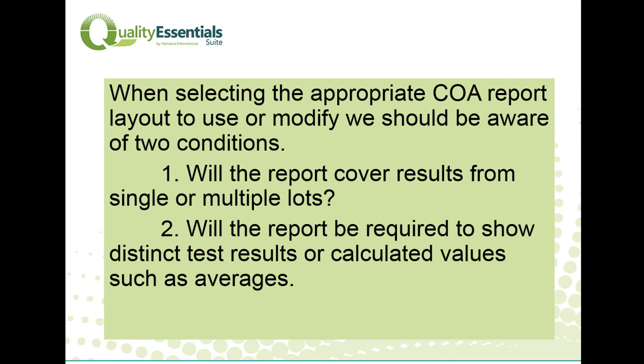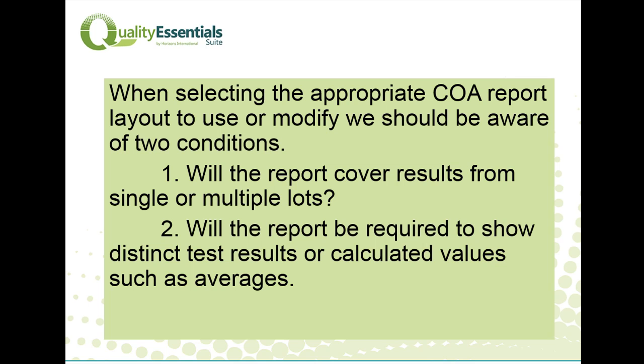In our next step, we have to select the appropriate COA report, or modify an existing report and give it a new name so that it can be used specifically for the customer. When we're considering what COA report layout to use, we should consider two factors. First, will the report cover results from single or multiple lots? Second, will the report be required to show distinct test values for each of the lots, or calculated values such as averages?